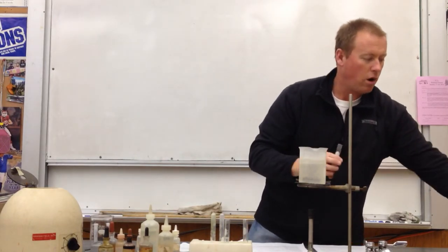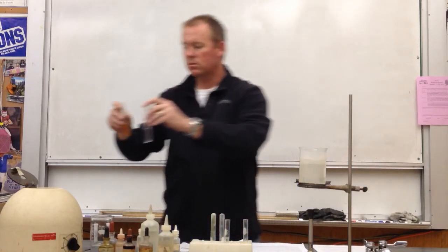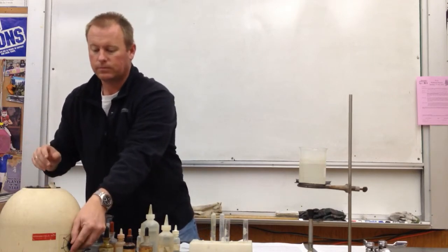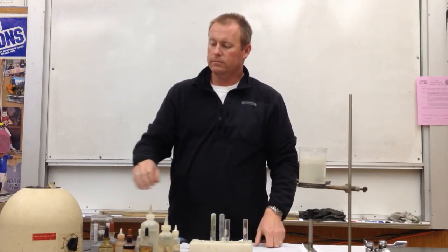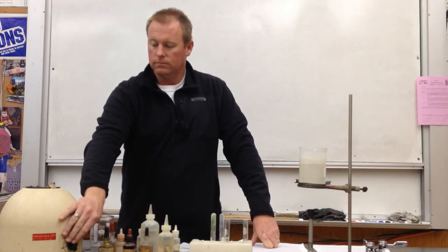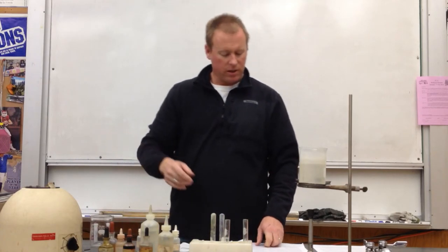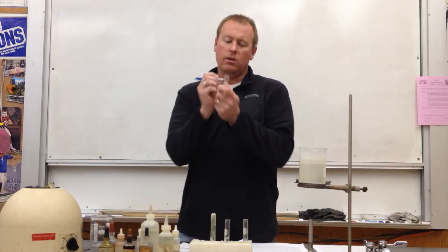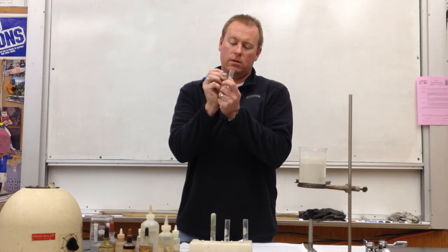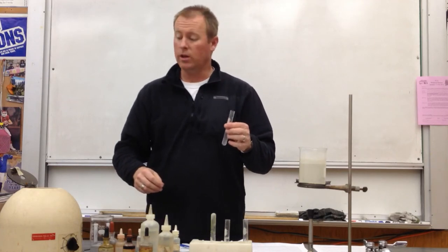So I'm going to get my test tube of water, an equal amount. Okay, now when this comes out, like the procedure says, that we're going to set the solution aside for procedure 8. So I'm going to go ahead and get a test tube labeled with the number 8. And I'll be pouring the solution into that test tube and setting it aside for use in just a little bit.